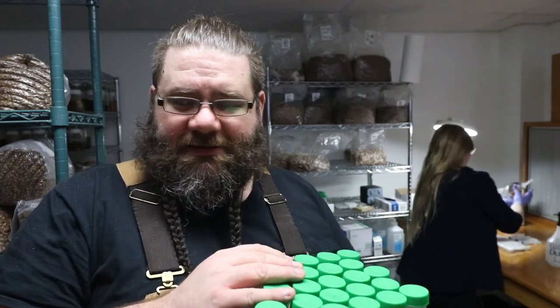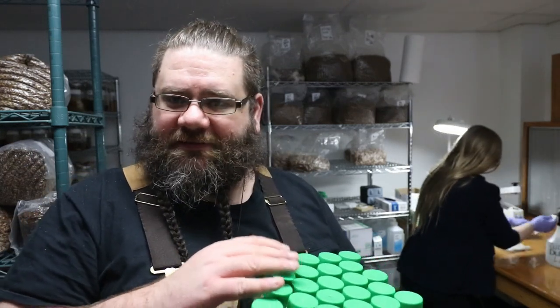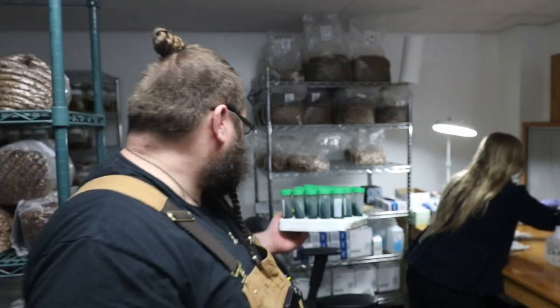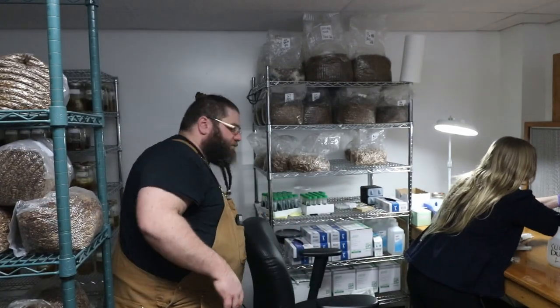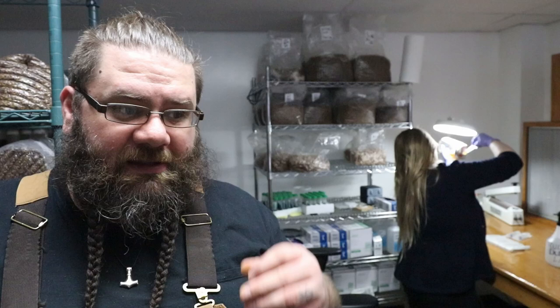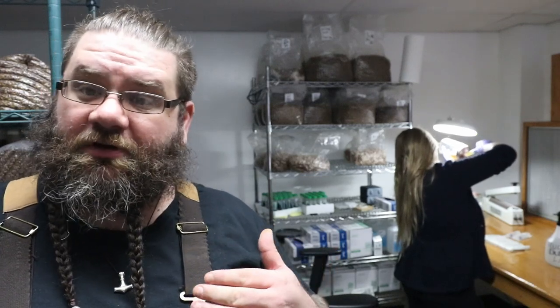So I have found that with pressure canners, you can absolutely make these. With the autoclaves, it's hit or miss for me right now, and I'll go into how I do pre-made slants in a later video. But when you're working with pre-made slants or really agar work in general, I find that the sterilizer is the best unit to go with. It holds the pressure, which means you don't have a lot of agar boil off. It also has a little bit finer tune.